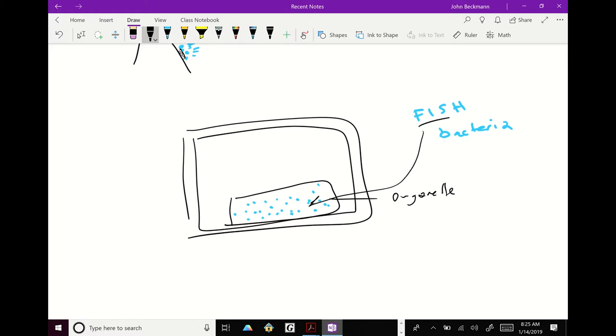Okay, so FISH will tell you where a specific gene sequence is, and the key is specific. You have to design the oligo probes. Okay, it's going to tell you location. You can also do it with messenger RNA. It's a nucleic acid technique. Usually most of these nucleic acid techniques, if you can do it with DNA, you can do it with RNA. So you could also do it with RNA, but then you're measuring transcript location, not genome location. So you've got to know what the people are doing.